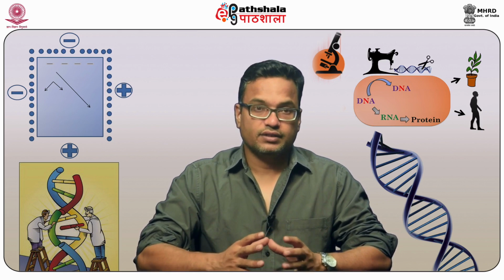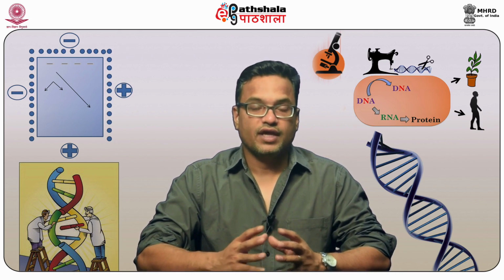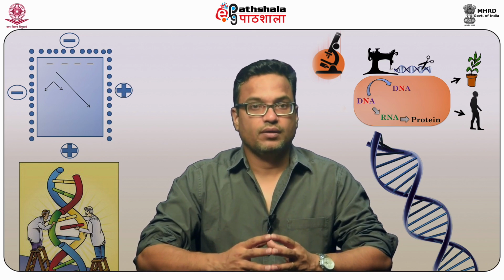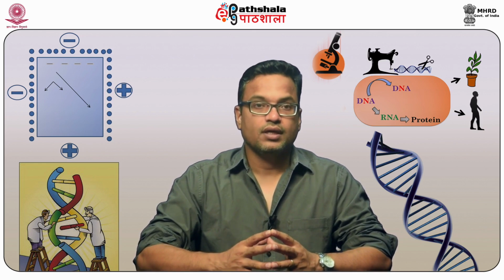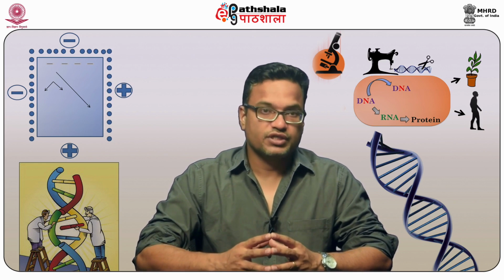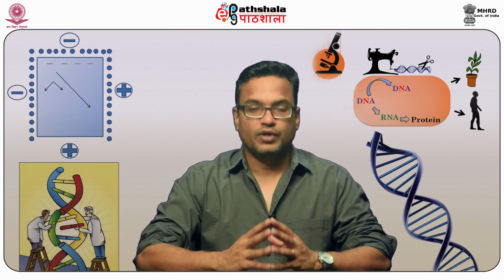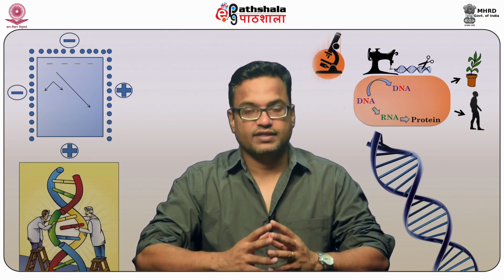Last and least is recombination-based cloning system. Gateway cloning is part of this recombination-based cloning method. There are two methods in it that are available commercially right now. One is infusion cloning and second is gateway cloning. So we'll talk about gateway cloning in detail in next slides.